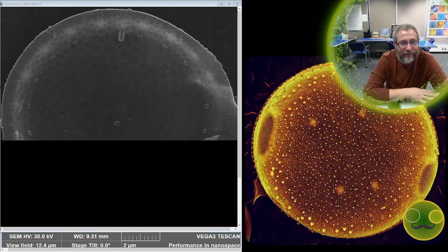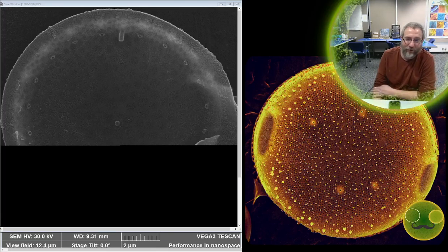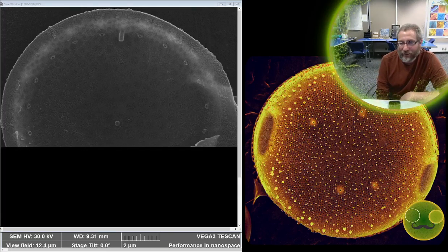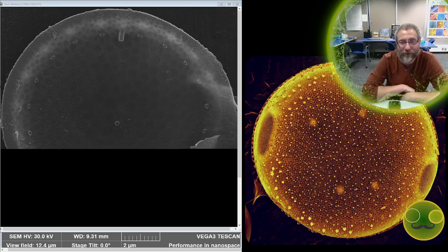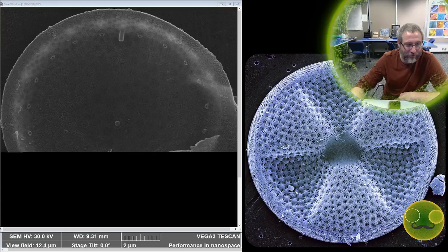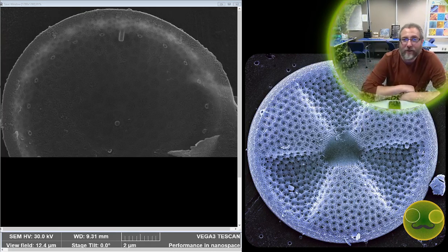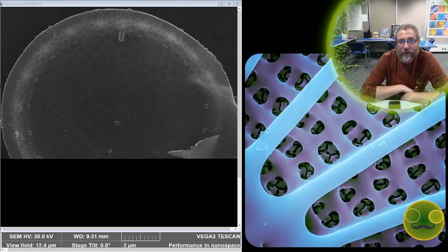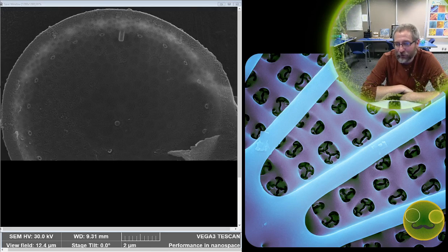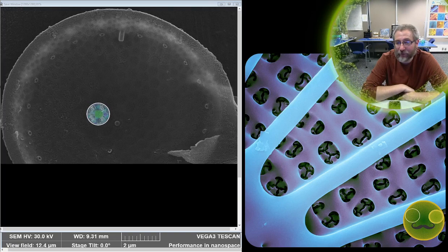And then they have their own diatom culture. So rather than going out into nature to get a sample, they can just basically grab it from their culture in their lab. And one of the things that happens when you culture things is that the organisms aren't in a natural environment. And even though you can add things that would be seemingly the right things to make their environment correct, sometimes they just do crazy things and you end up with these sort of weird beasties that don't fully form, or they don't form correctly, or any number of things might happen. I think that these were originally collected from natural sources, and then they isolated the species that they were interested in growing.